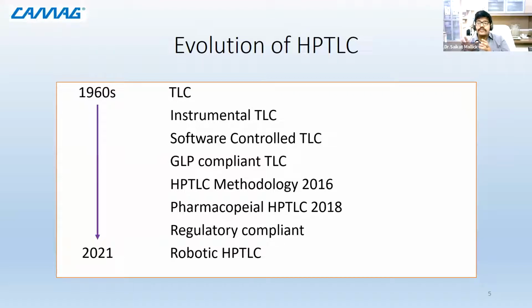Even in the food industry, when chips are being produced and everything is standardized, the temperature and so on, this all takes place with the help of instrumentation. The machinery is developed so that it maintains all parameters, and it gives you the same reproducible taste, same flavor, everything the same, because everything is standardized. And that is what happened with TLC also. Instrumentalization was brought in.